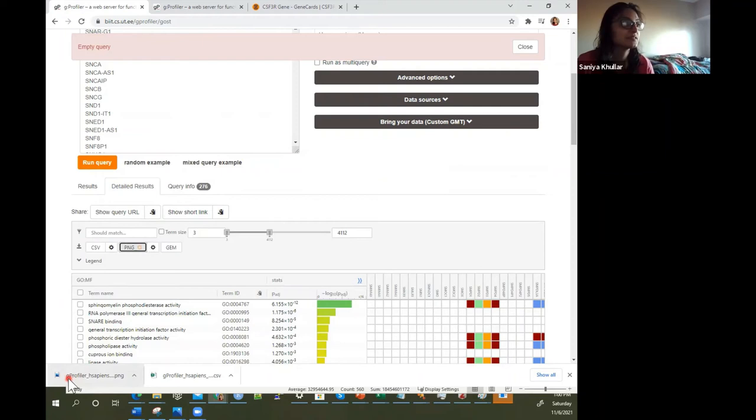We can save the PNG — a snapshot of the results — and we can also have the CSV downloaded for all these enrichment results.